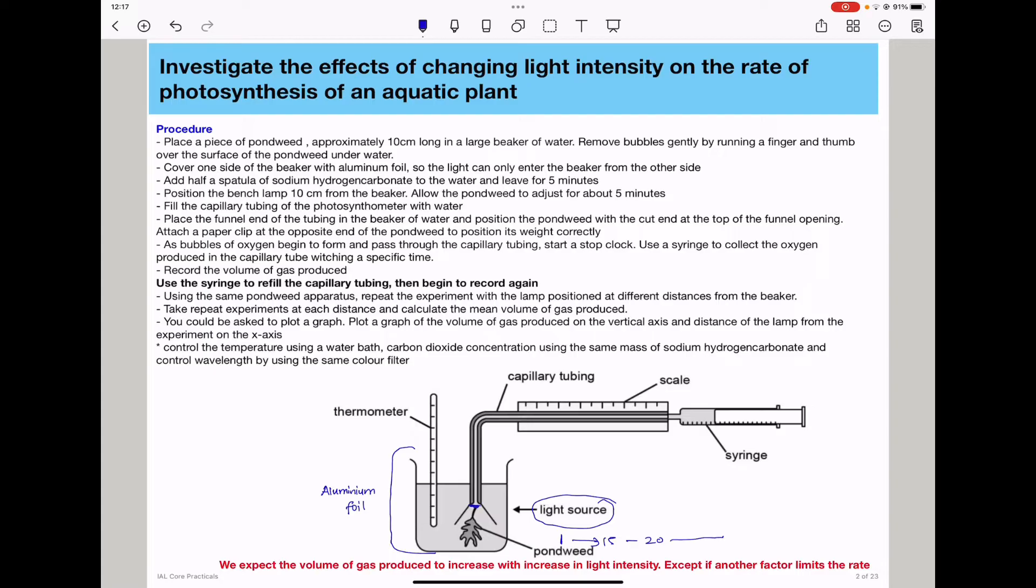So my procedure is as below. You need to place a piece of pondweed, approximately 10 centimeters long in a large beaker of water. Remove bubbles gently by running a finger and thumb over the surface of the pondweed underwater. Then you cover one side of the beaker with aluminium foil so that the light can only enter the beaker from one side. As you can see, light should only come from this direction.